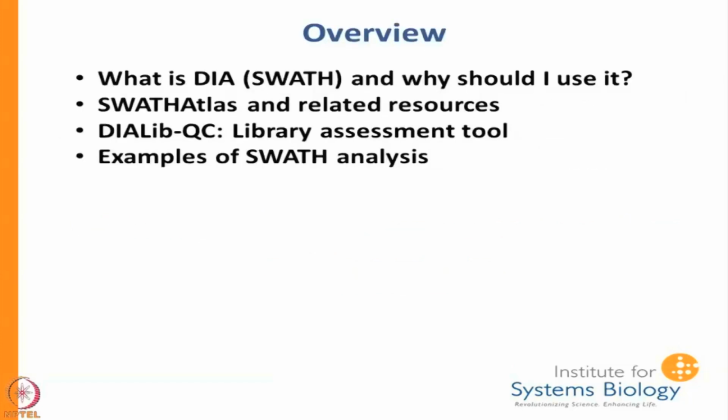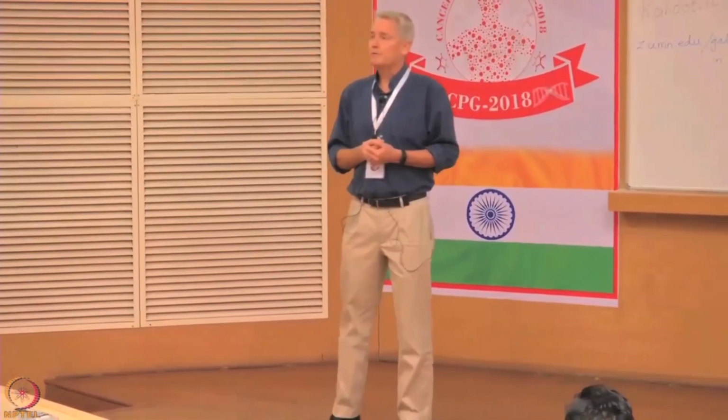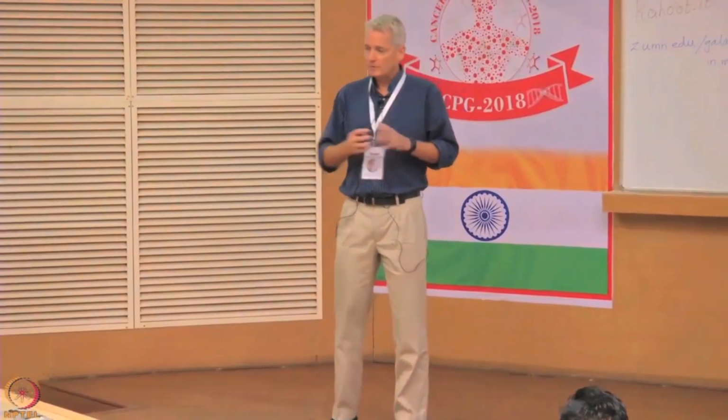So basically this is an overview of the talk. First of all, I'm going to try to tell you what SWATH is, DIA or SWATH, and why you would want to use it. I'm going to talk a little bit about SWATH Atlas and Peptide Atlas and some related resources that are out there that you can use.